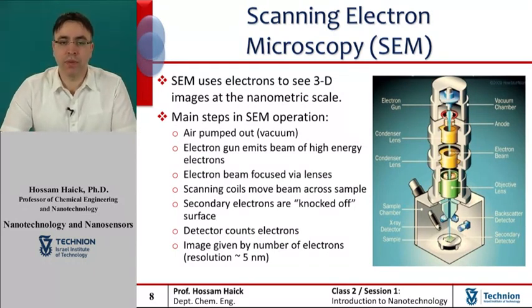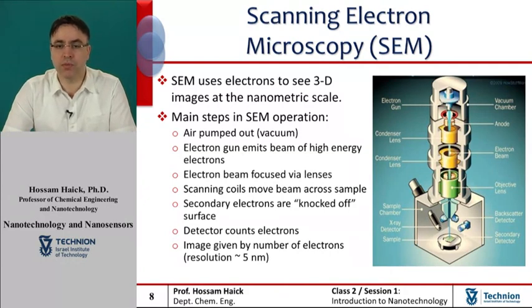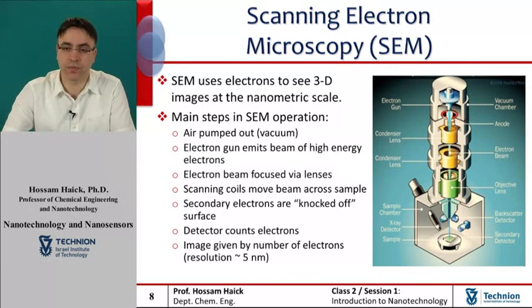When the primary electron beam interacts with the sample, the electrons lose energy by repeated random scattering and absorption within the teardrop-shaped volume of the specimen known as the interaction volume, which extends usually from less than 100 nanometers to around 5,000 nanometers into the surface. The size of the interaction volume depends on the electron's landing energy, the atomic number of the specimen, and the specimen's density, of course.